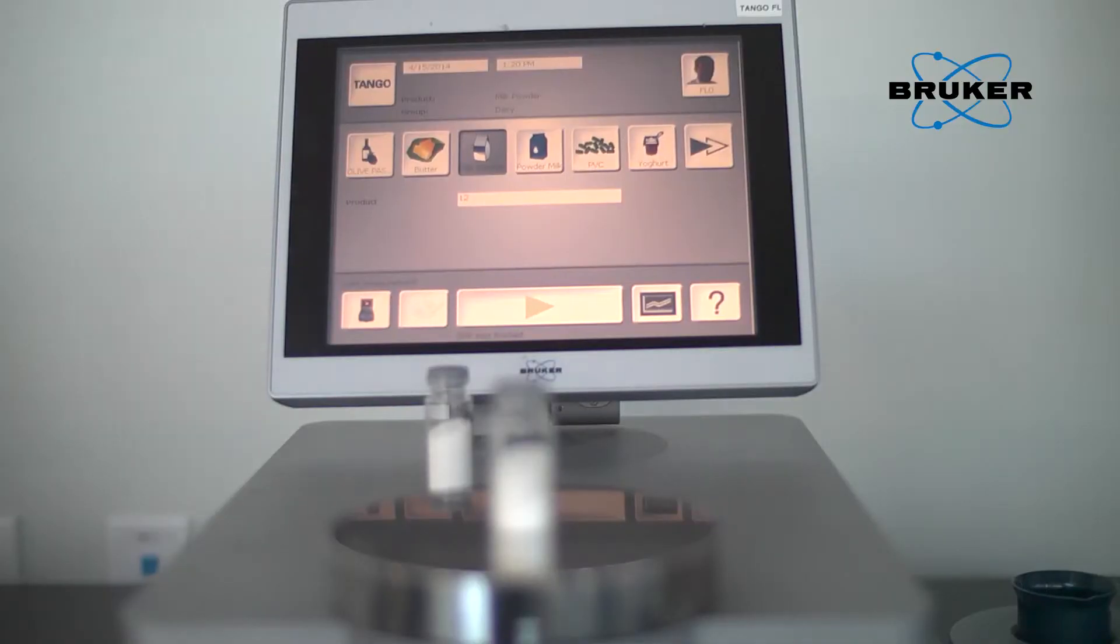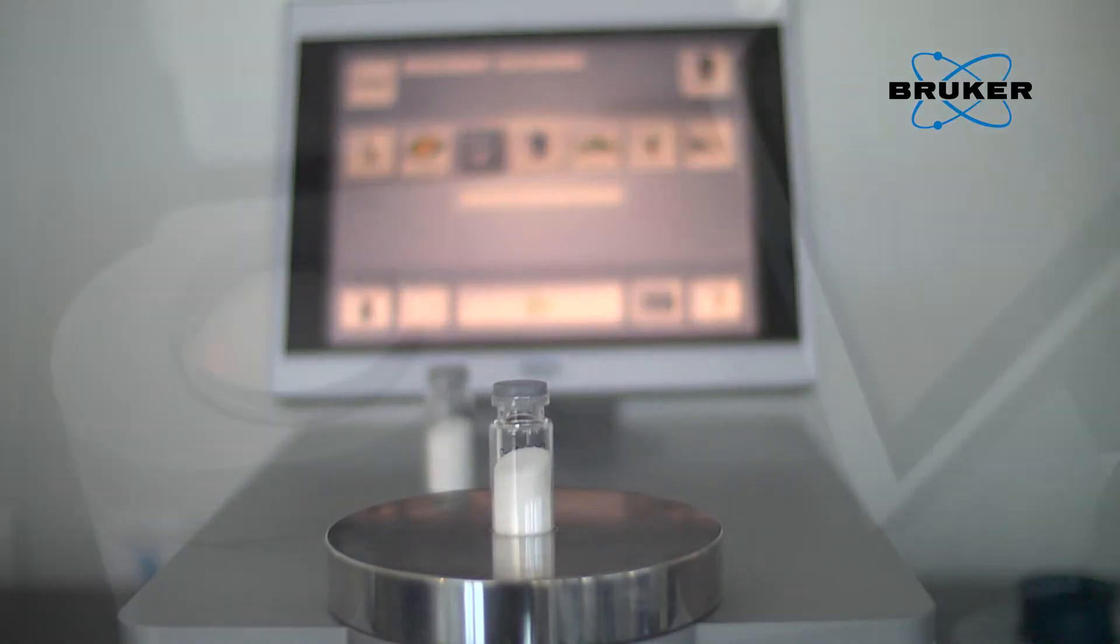The Tango-T comes standard with an active heating and cooling system which monitors the vial inside the sample compartment, ensuring that your measurement is at the correct temperature. Temperature settings run from 20 degrees Celsius all the way up to 80 degrees.